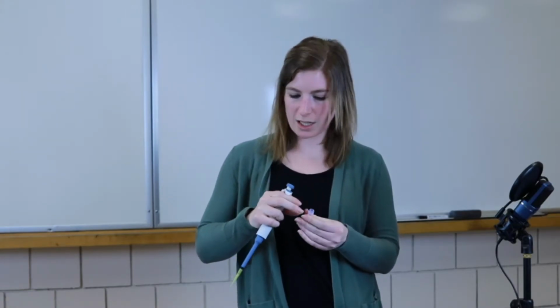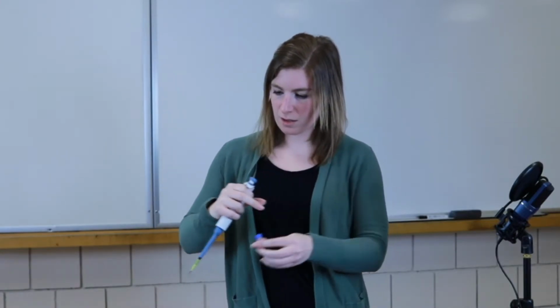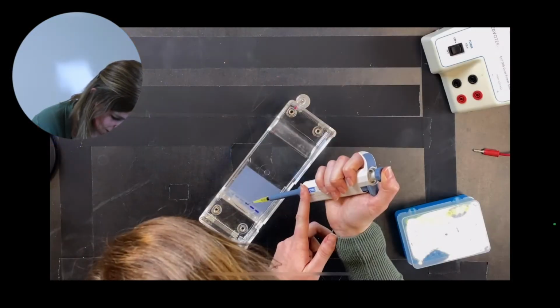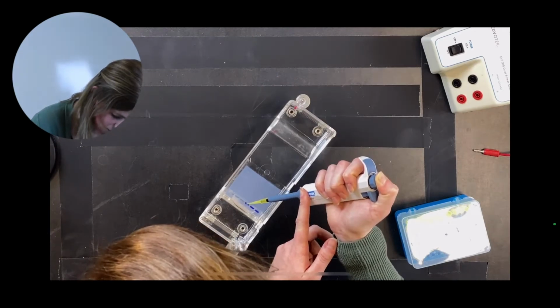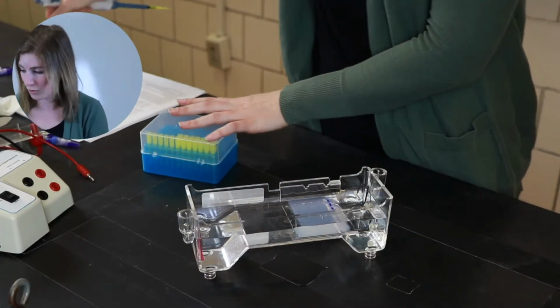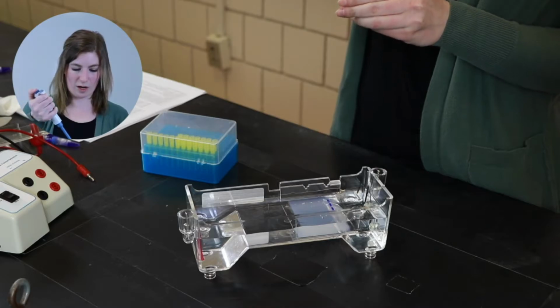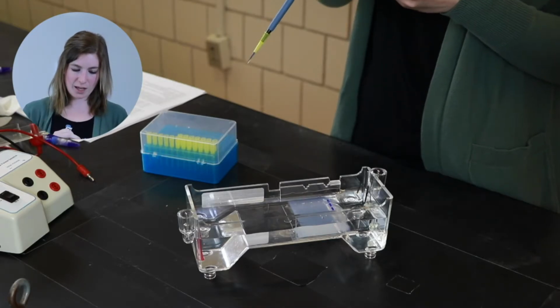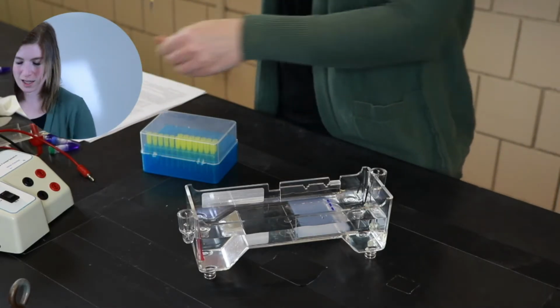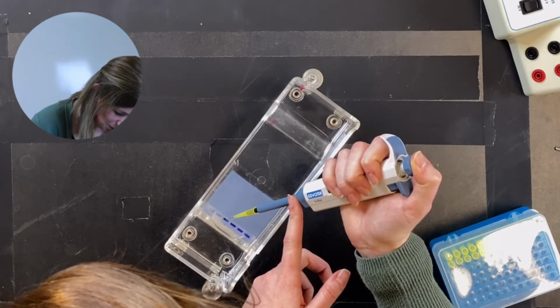So my blue sample is suspect number 1. And I'm going to put this into lane 3. So you should have already read the scenario and have an idea of what the crime was that occurred, but we don't know who actually did this. And this is a technique that could be used in real life too, if there were various samples of DNA that could be compared to a crime scene DNA sample that was collected. Of course, they would probably use some other evidence as well prior to convicting somebody of something, but it definitely is helpful and something that is fairly new when we think about technology.